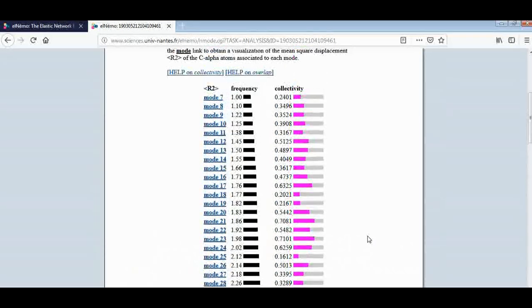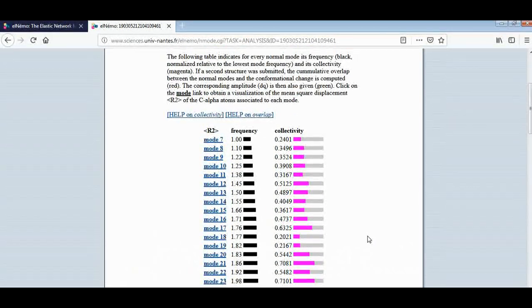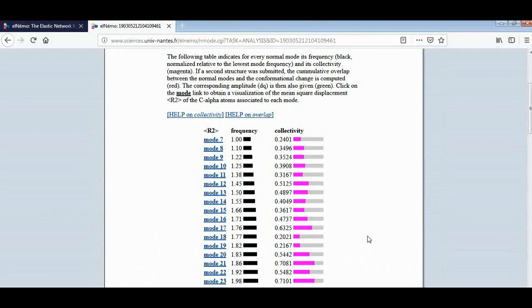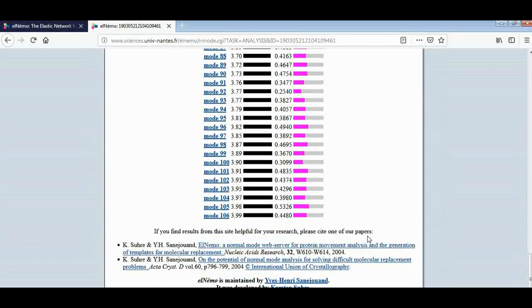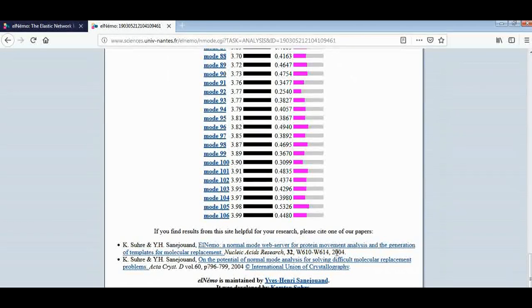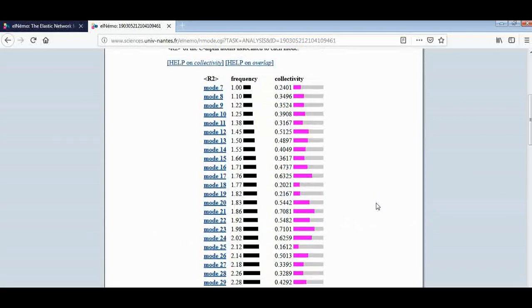For this we can easily check the conformational change of our macromolecules by this web server. For the reference point of view, you can refer any kind of this paper for writing purposes also.